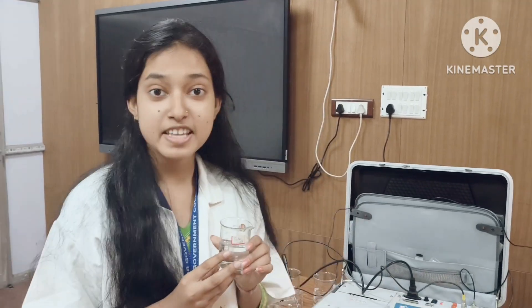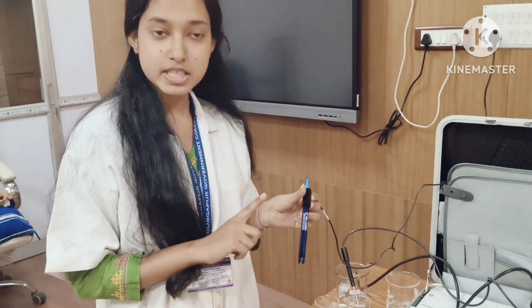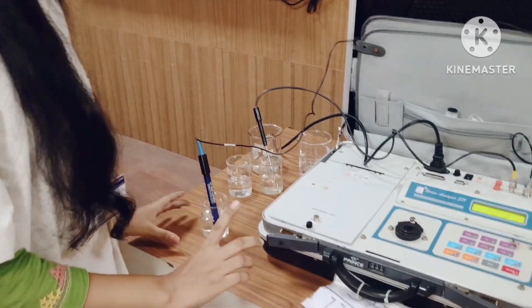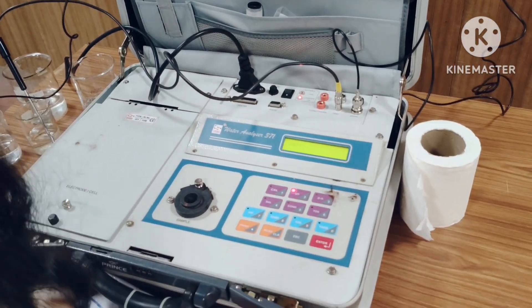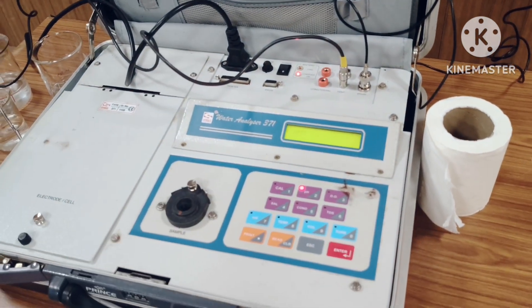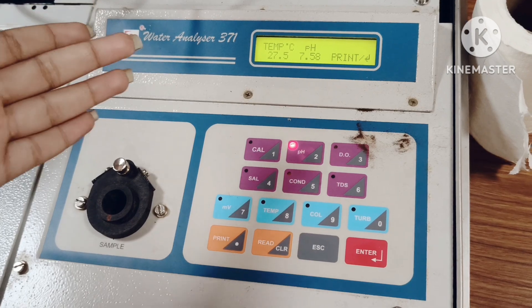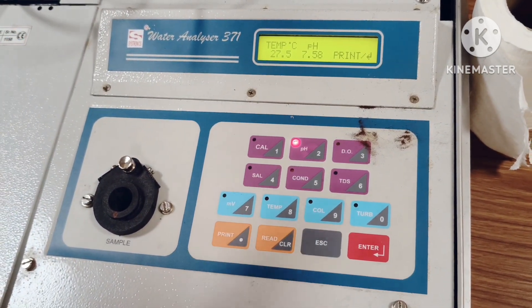Our next sample is tubewell water. First we wash the electrode with distilled water, then put it into the sample, press pH and enter, and wait. The pH of tubewell water is 7.58 at 27.5 degrees Celsius.